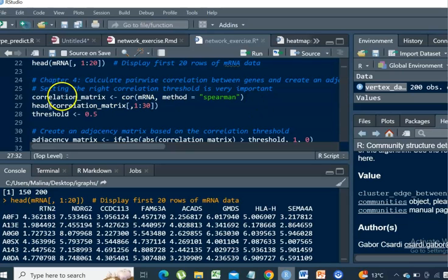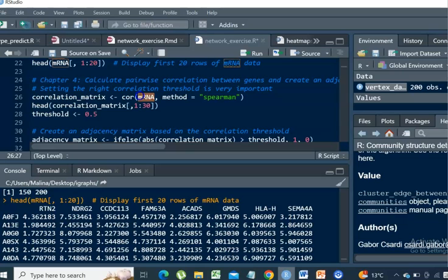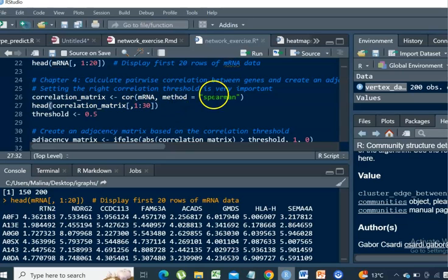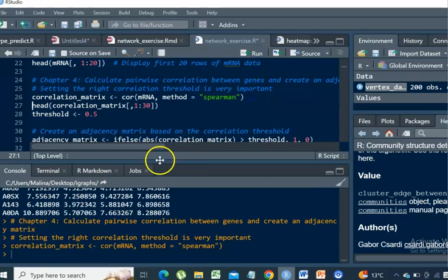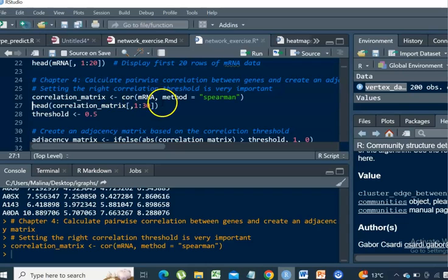So we put our mRNA data frame as input and run the correlation function. We're going to obtain a correlation matrix as a result of that.